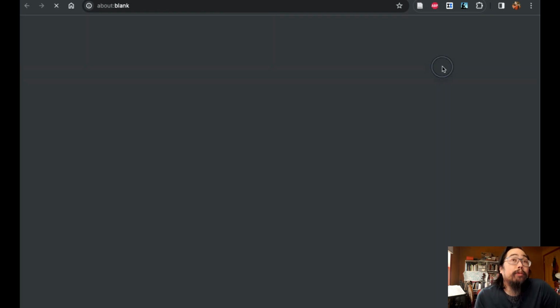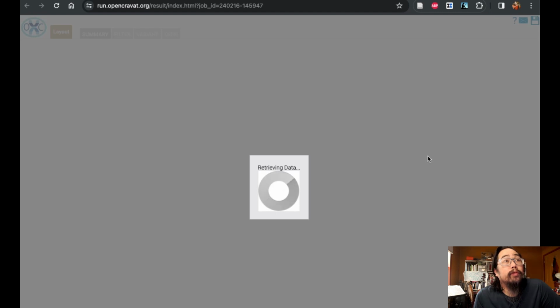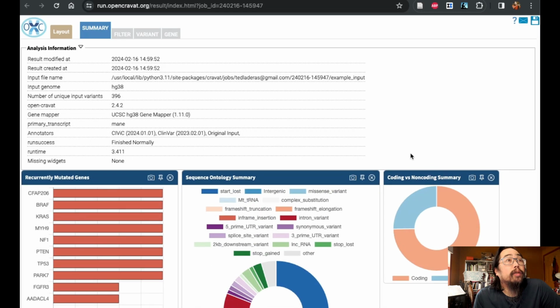So I'm going to open up the result viewer. This is our results file. We don't have that many variants. You can see we have 396 here. But let's just pretend that we want to filter it down.